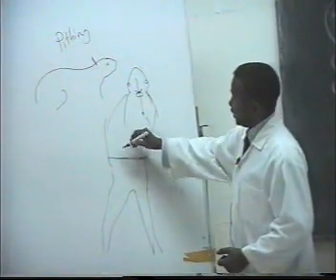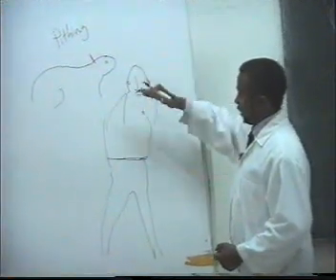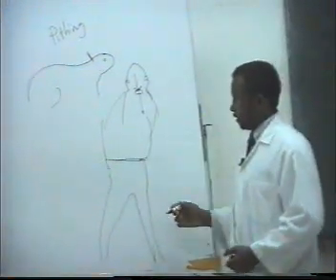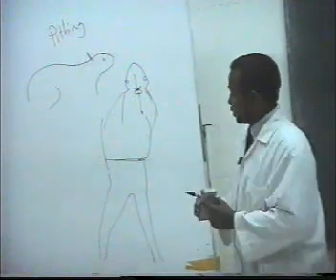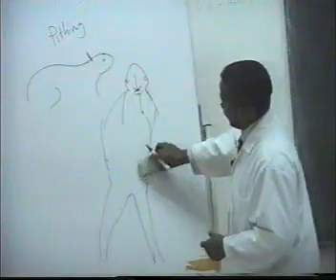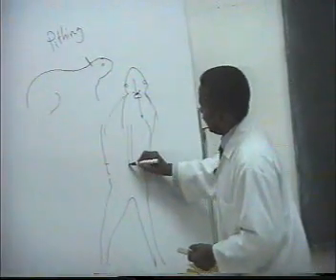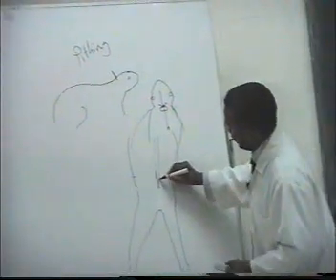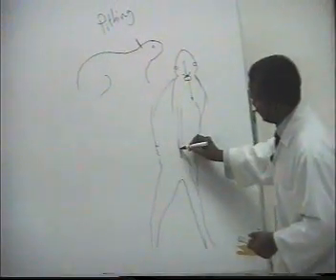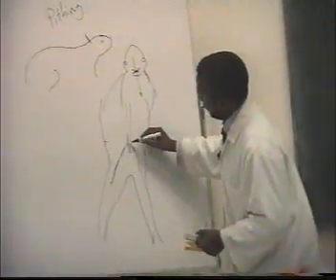After that we open the abdomen and remove the visceral organs cranially. When we remove the visceral organs, we see the vertebral column, and at the end are the two whitish-colored sciatic nerves.